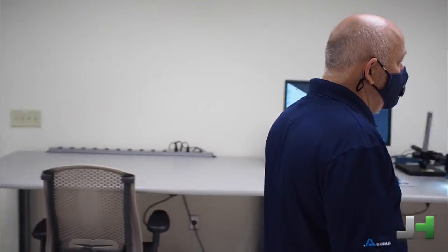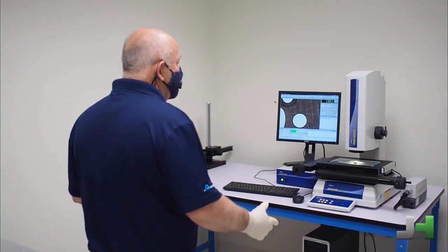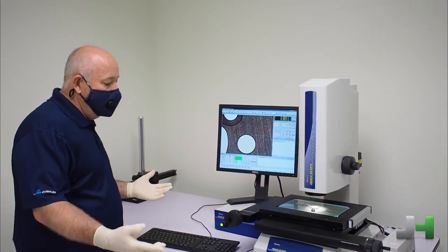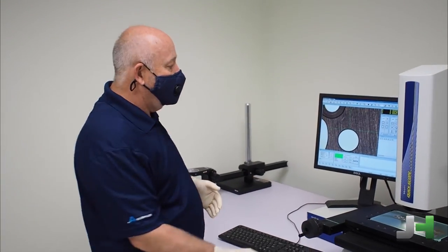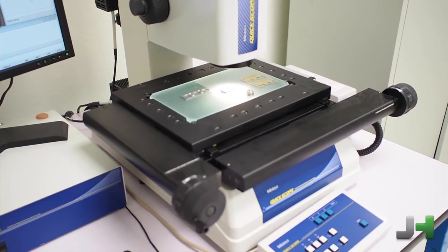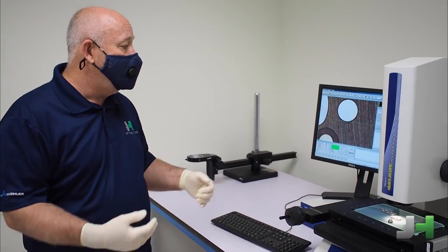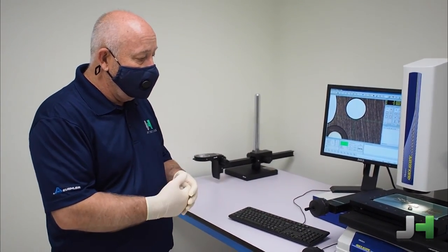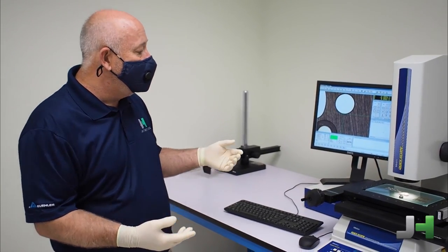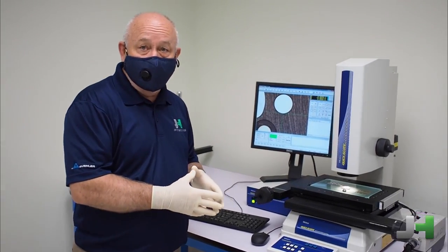We have an imaging station here. And then over here, we have a quick scope, which is the manual version of the quick vision. There's some automation to it. So snap to grid or snap to edge works very well on this tool, but it gives you all kinds of capabilities, but in a manual fashion.